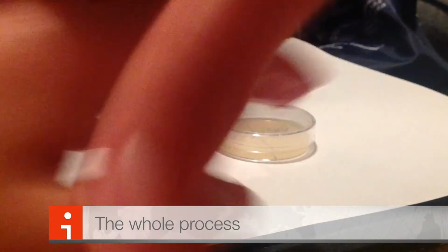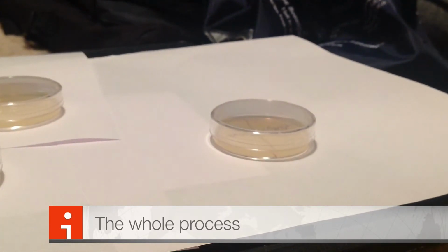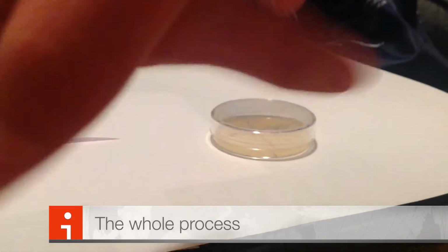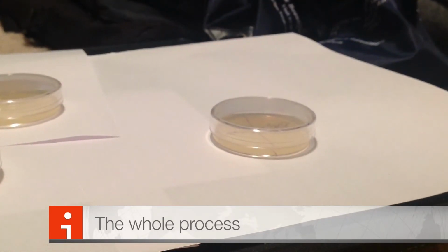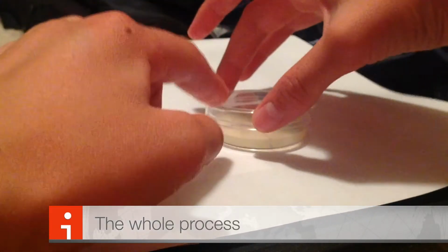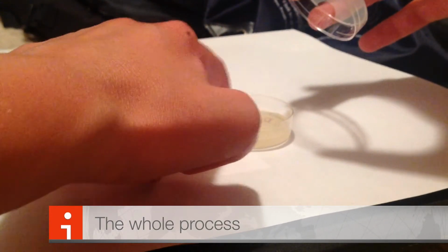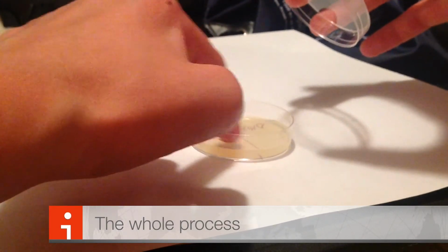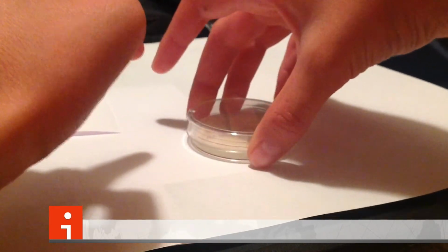And here, the process. I'm just showing you that first I wrote on the petri dish, so after I take it out of the incubator, I know which side is the dirty one and the clean one. Then I swipe my dirty fingers on the dirty side, and my clean fingers, right now I'm swiping them on the clean side. So after this, I'm going to put them in the incubator and see what grows on it.